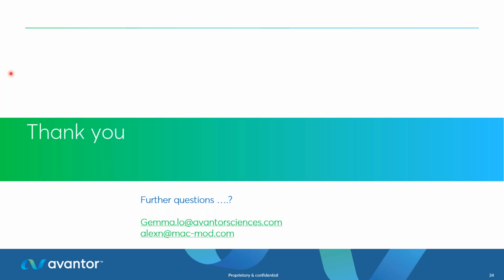First question, is there a certain number of chemistries that you recommend when you're starting a method development project to try? That's a really good question. We've worked with different companies over the years who have had different strategies. We tend to use 6 more because our instrument can take 6. So we've got a 6-column screen, and that's what we utilize.